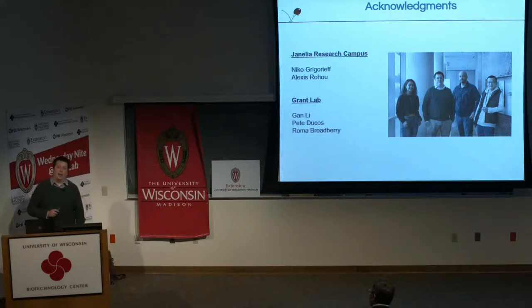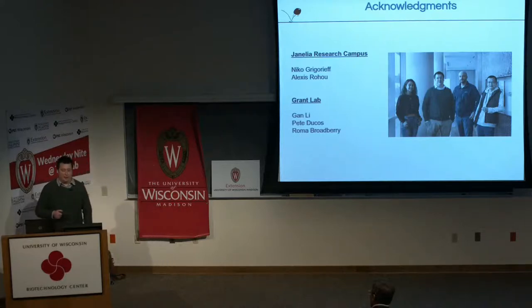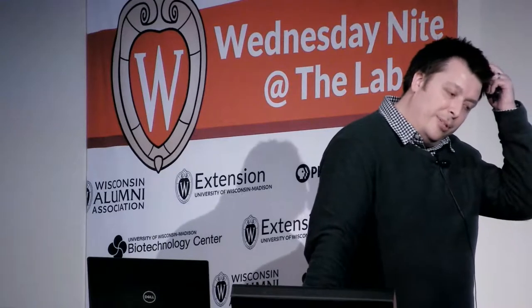Yeah, so certainly, you can look at this in the real maps and you can see the different residues behave differently. In terms of the filtering, you can't really use that information very easily. But yeah, you can analyze maps. In terms of using it to decide what amino acid you have, I'm not aware of people who have done that. I guess possibly you could do it.